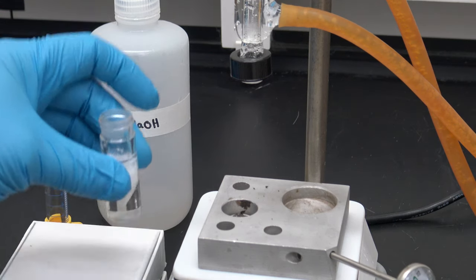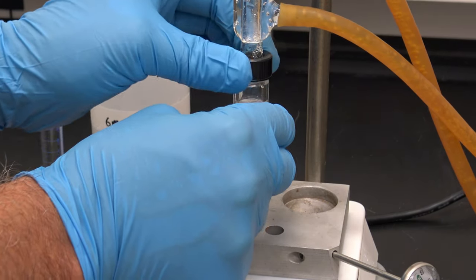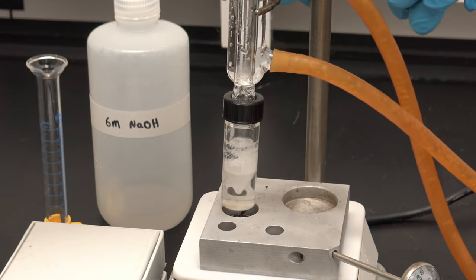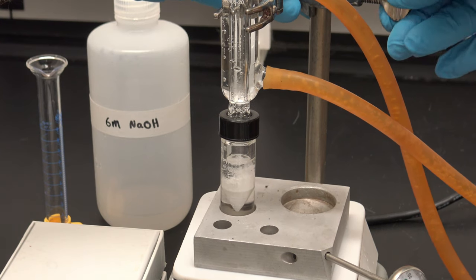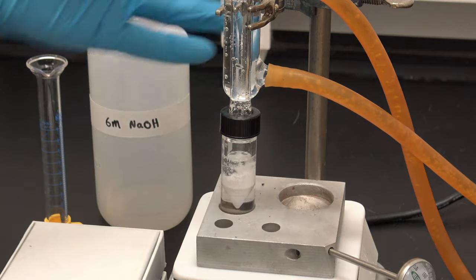I'm then going to attach it to my reflux condenser and lower it down into my heating block, making sure there's a tight fit down against the bottom so I get good thermal transfer.